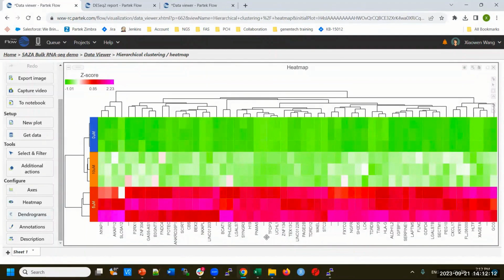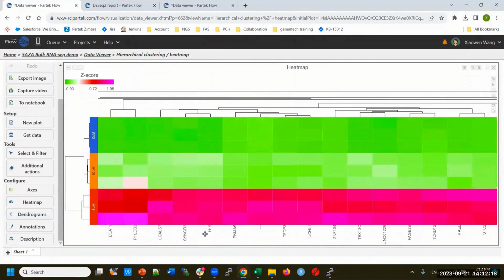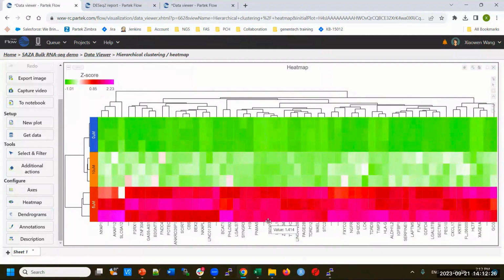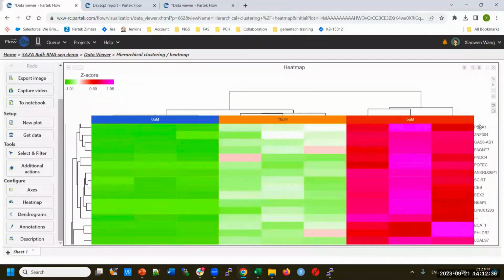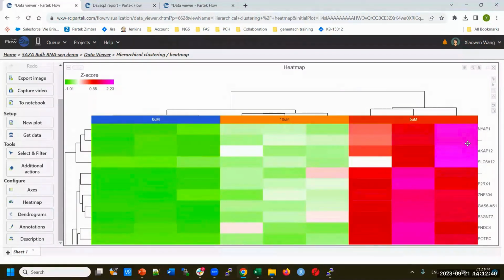You probably say, okay, I don't see all my genes. You can zoom in by scrolling your mouse wheel, and you can see all the genes. It's because you might not have enough pixels to display all the genes. So when you zoom out, especially if you do it this way vertically, I don't have enough space. One pixel probably represents multiple genes. We just pool all the neighboring genes together. When you zoom in, you're going to see more genes, right?